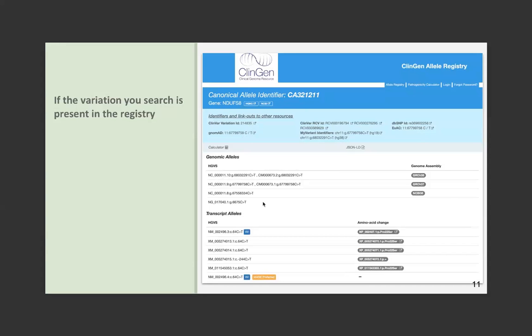On the top panel, I have the HGVS expression. What we show is HGVS expressions as a function of genome assemblies, and on the bottom panel we show the HGVS expression as a function of transcript and corresponding amino acid changes. And you will notice that it has these two particular link outs. The VV is for Variant Validator, which has recently been published, and they say that it helps you make sure that your variant is represented correctly. So feel free to use that.